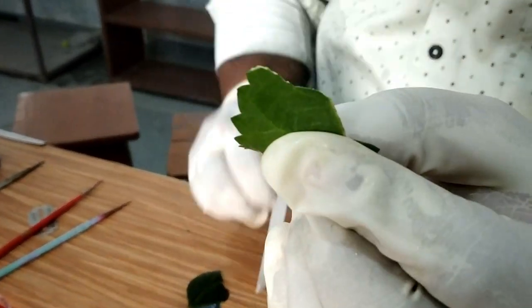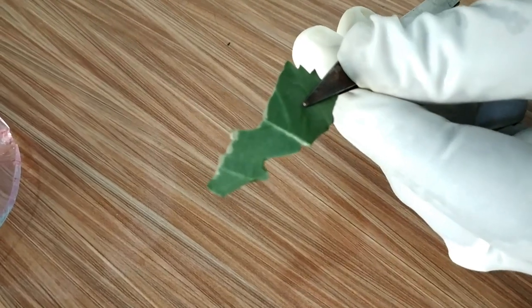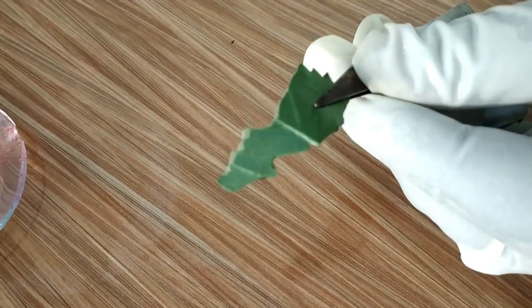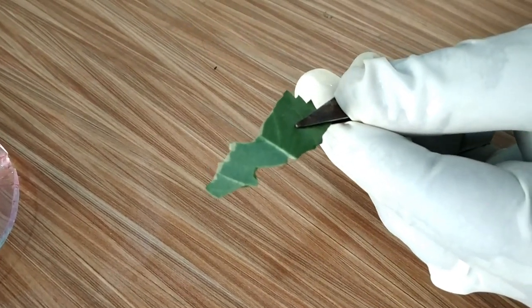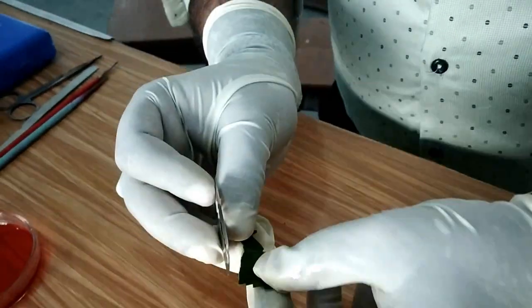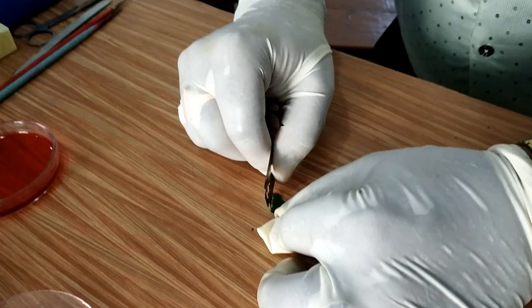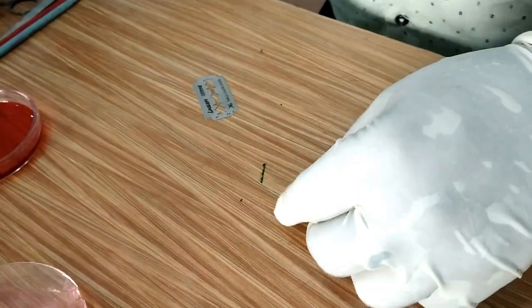Here you can see I have got a transparent peel, and then I will be taking this peel on the slide. After cutting it with the help of a blade, we need to cut that epidermal peel with the help of a blade.